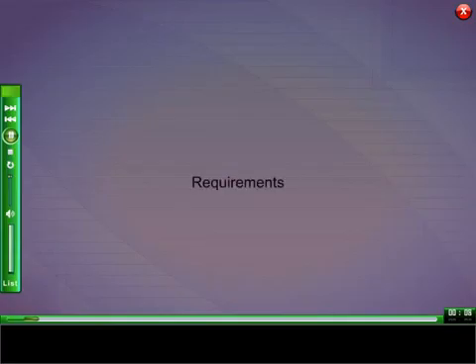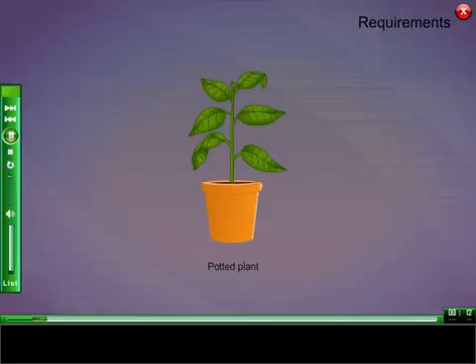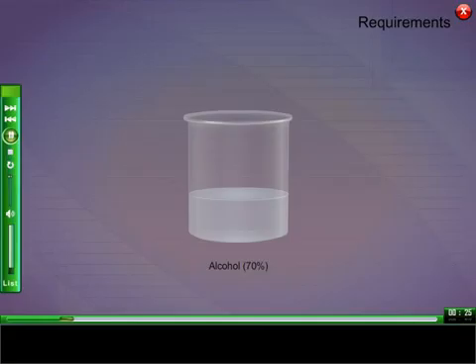Requirements: Potted plant, Petri dish, boiling tube, alcohol 70%, iodine solution.